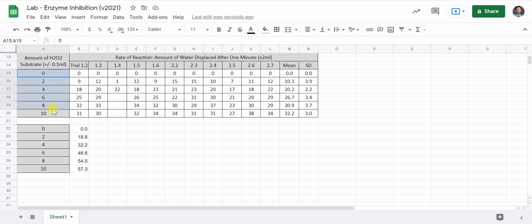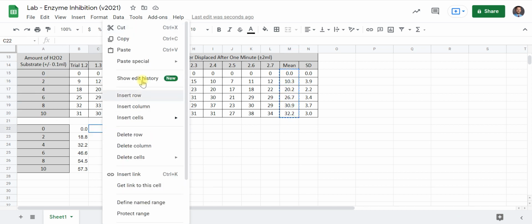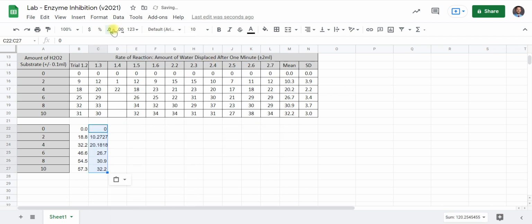But we're going to have to do the same thing for the next one. And to do this, I don't have to copy the X again. Instead, I'm going to copy the Y, and I'm going to paste it right here as a value only. Then it doesn't copy the equations. So don't do this part, just watch what I do here.